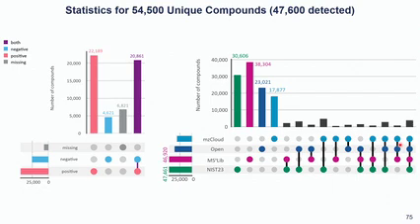And then if we go to the upset plot, we see that we now have the most unique structures compared to other databases, but it's not a surprise because we try to include everything that we get. So also a lot of synthetic compounds. We are not biased towards only one compound class, because we think it's valuable if we think about future machine learning tools. It's good to have as many compounds and structures included in those databases.